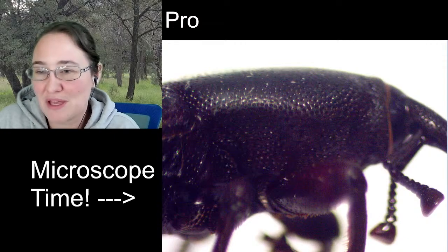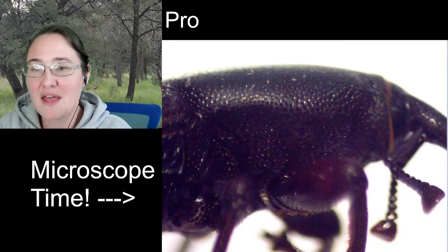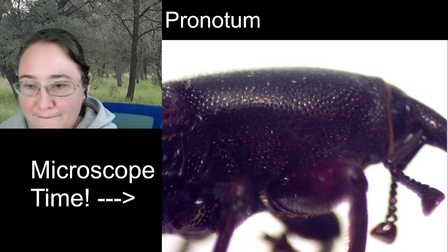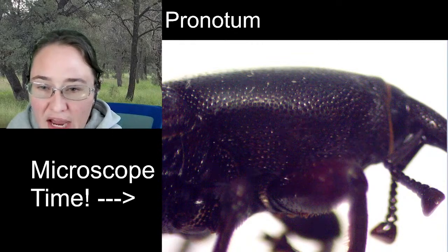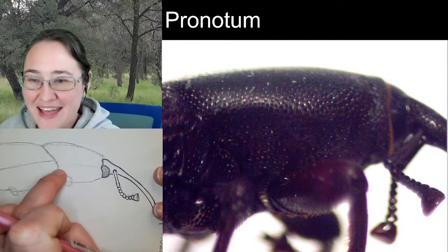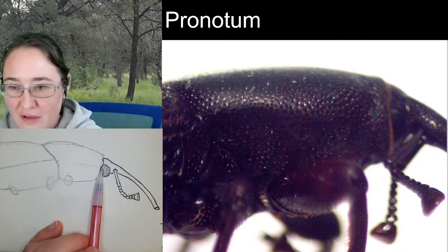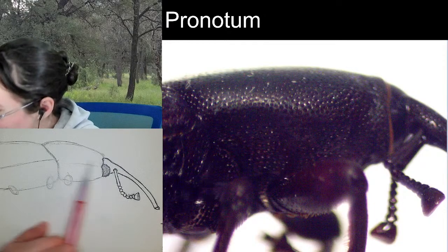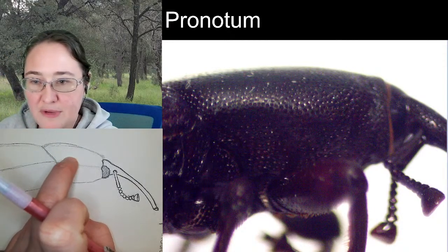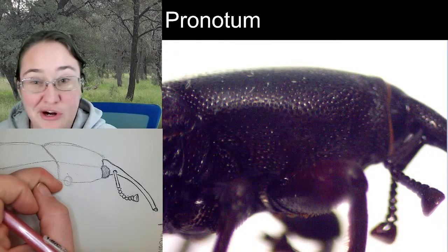The first segment of the thorax generally has this pro in the beginning of the name, and we are looking at the pronotum here. Now, if you kind of imagine where that light goes into shade, that's this lateral line that you can draw from right here at that point on the eye to right here at the edge. That light is hitting our beetle right here, because that's where it kind of turns the corner and everything kind of gets dark after that.